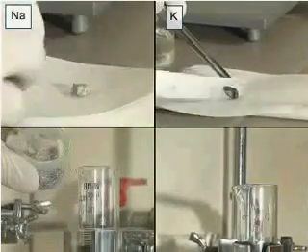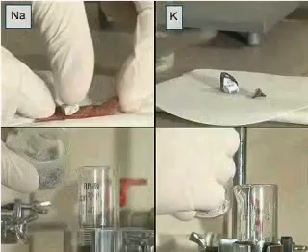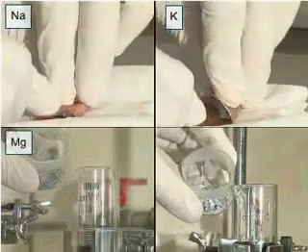Next, we will add small samples of the following metals to the cylinders, one metal to each cylinder: sodium, potassium, magnesium and calcium.